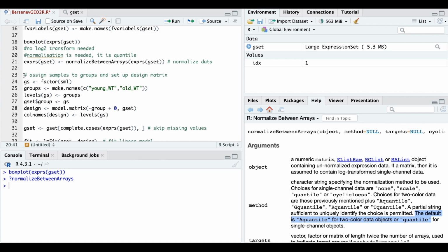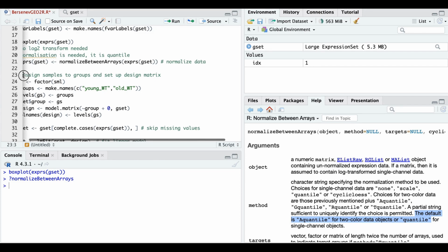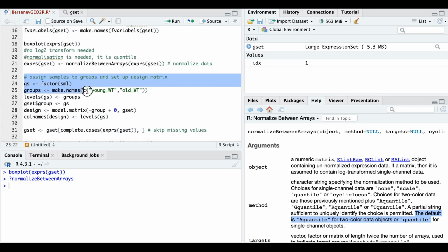Here, because we deleted a chunk of the lines on the top, this will not work. We have to define the groups we compare. For this, we have to rewrite the whole business differently.